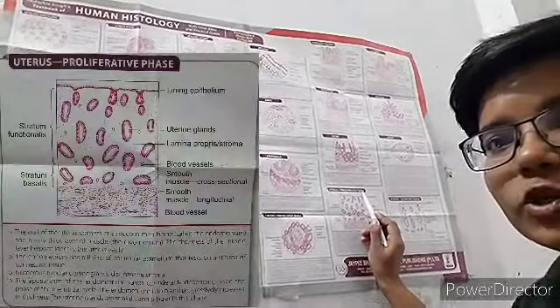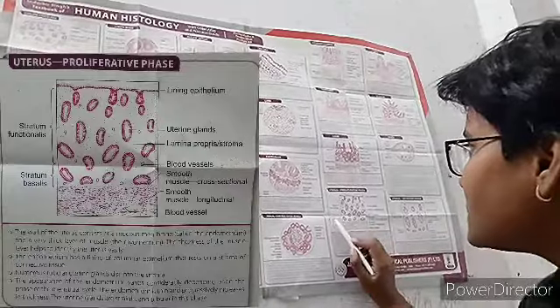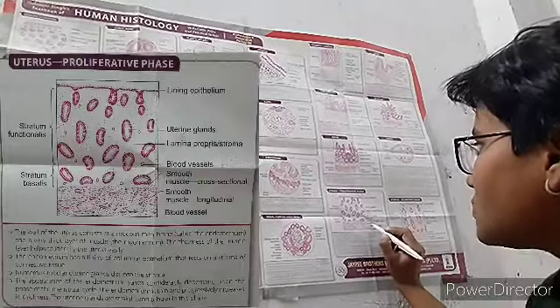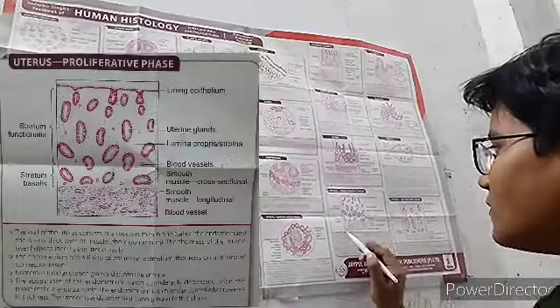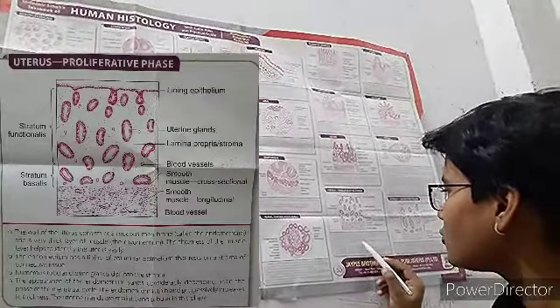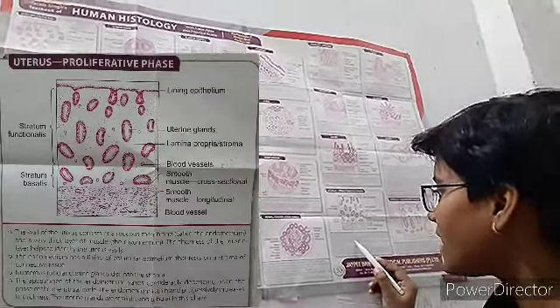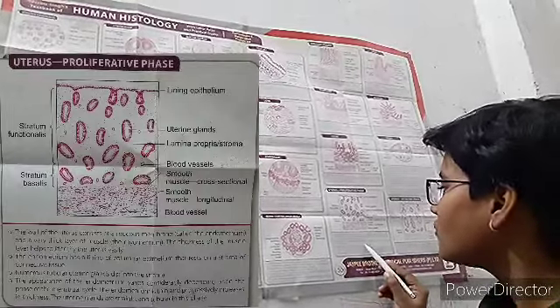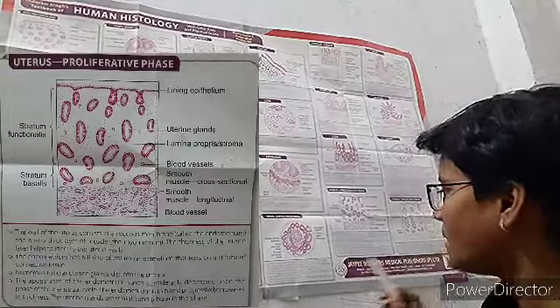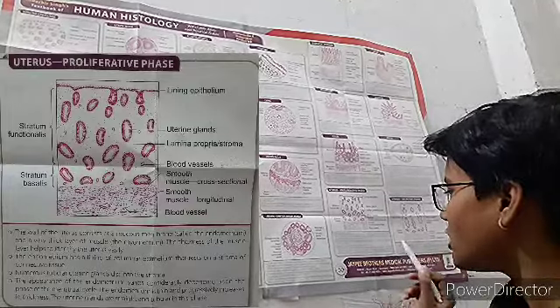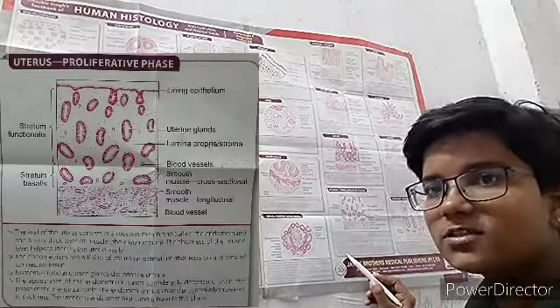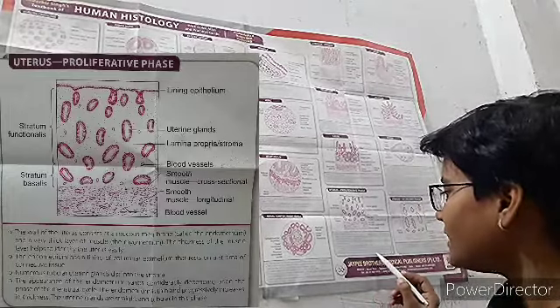Now the uterus in the proliferative phase. Visible structures include stratum functionalis, stratum basalis, lining epithelium, uterine glands, lamina propria, stroma, blood vessels, and smooth muscle. The wall of the uterus consists of the endometrium and a very thick myometrium. The endometrium has a lining of columnar epithelium resting on connective tissue stroma, with numerous tubular uterine glands dipping into the stroma. The endometrium is thin and progressively increases in thickness during this phase; the uterine glands are straight and tubular.